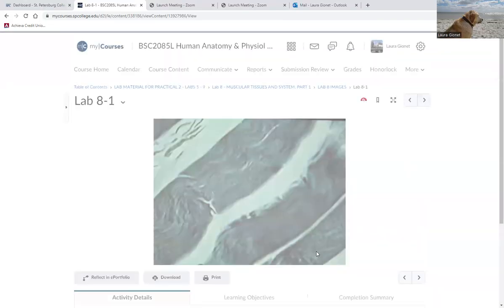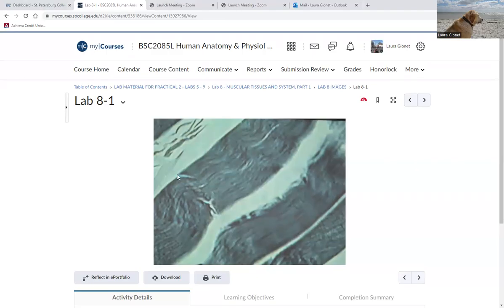If we look at these fibers, we can see them very, very parallel to one another. And if we magnify this a little bit more, you can see the multinucleated nature of these muscle cells, and you can see these lines. So here we have these muscle cells and fibers, and they're parallel to each other. They have a little connective tissue in between, running at an oblique angle here. And you can just about see, running perpendicular, which means at 90-degree angles to the length of the fiber, these smaller lines, as if you took a pencil and drew these lines.